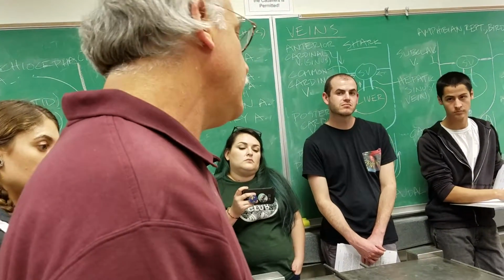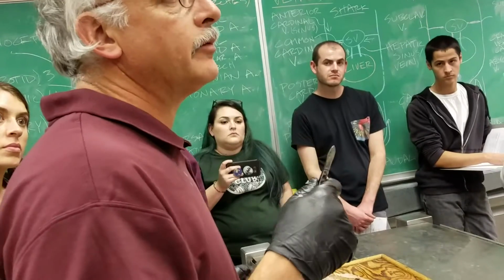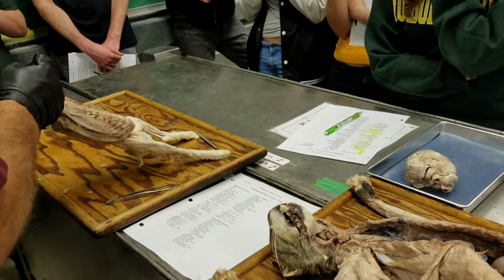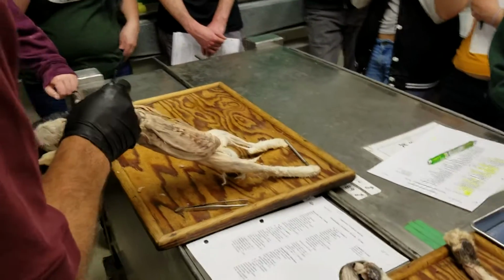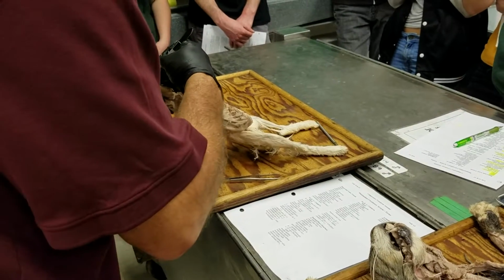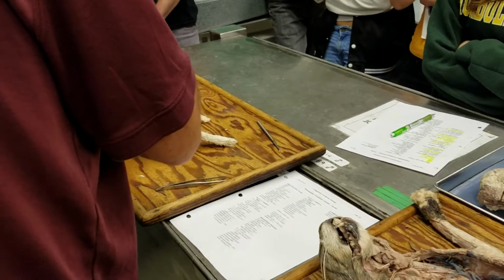Okay. And in people, clinically, this can be hugely important because if somebody has some kind of a clot in their carotid artery, they can still get blood up to their brain through the vertebrals. Finding them, on the other hand, can be a little bit tricky. And I'm just going to take a quick peek. Generally, where these guys are found is coming off of the subclavians, and you want to look for a small vessel. Ooh, I found it. Small vessel diving in towards the vertebrae from the subclavian artery.